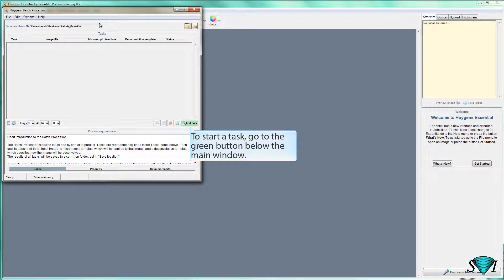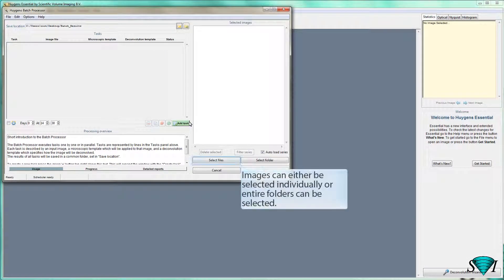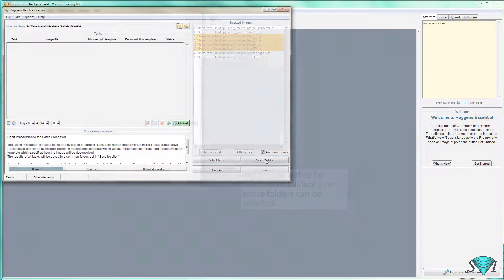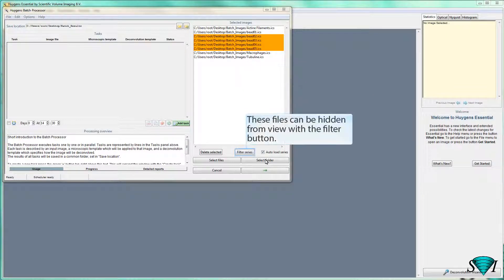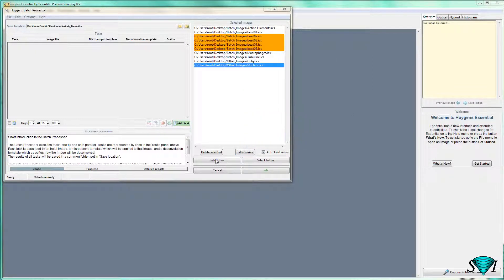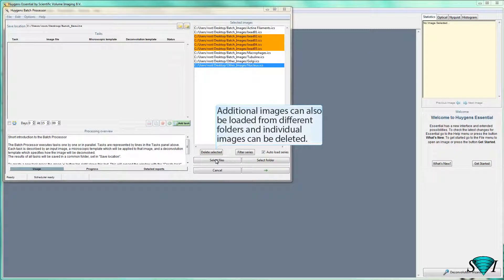To start a task, go to the green button below the main window. Images can either be selected individually, or entire folders can be selected. After the images are loaded, they are displayed. An orange color indicates that the image is part of an image series. These files can be hidden from view with the filter button. Additional images can also be loaded from different folders, and individual images can be deleted.